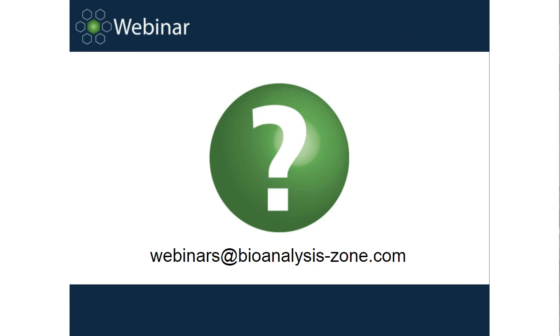Okay. And one of our listeners writes, great point on BSA and shipment issues. What alternatives would Paul suggest? We haven't put one in place ourselves yet. I know there's a company in Nottingham that makes recombinant human serum albumin, so maybe that would be a possibility. That company is called Albumedics. But yeah, I guess it's not something I feel fully qualified to answer at the moment, but anything recombinant or human derived to get around the veterinary import side of things would be my recommendation.